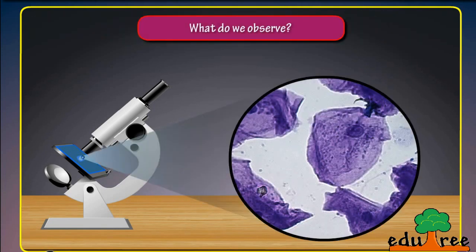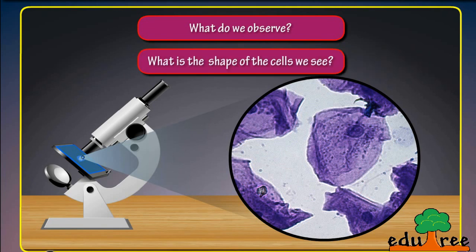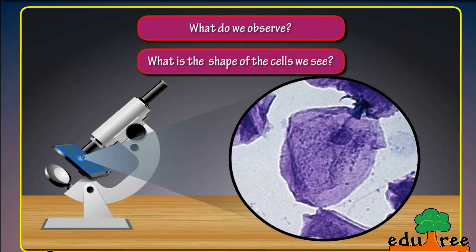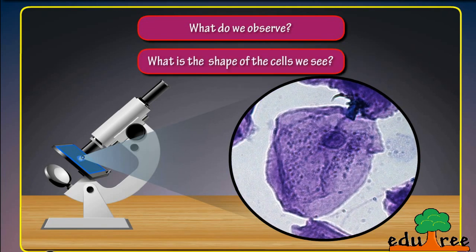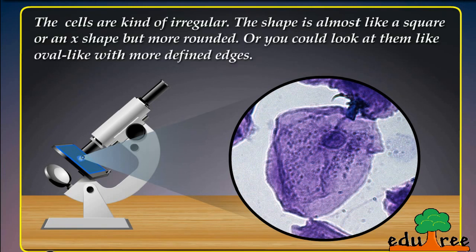What do we observe? What is the shape of the cells we see? The cells are kind of irregular. The shape is almost like a square or an X shape but more rounded, or you could look at them like oval-like with more defined edges.